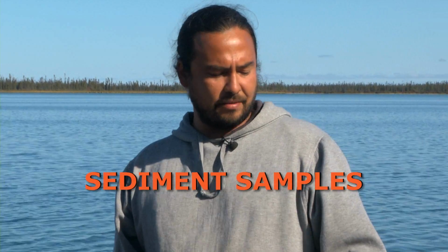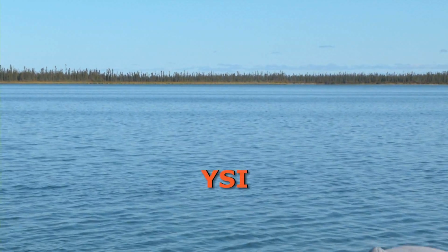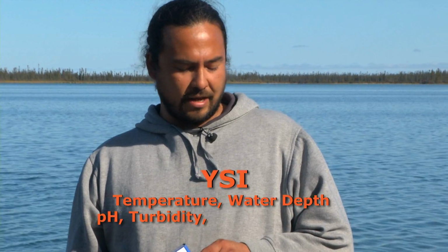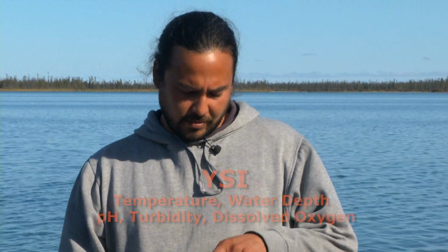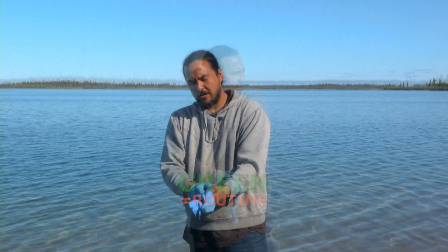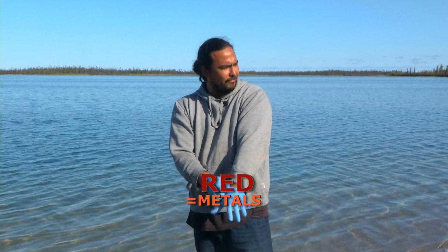We'll be doing the regular water samples. We'll be taking a sediment sample with the Ekman dredge, and then we'll be doing YSI, which will tell us the temperature, water depth, pH, turbidity, and dissolved oxygen in the lake. There are 3 different color jars. We have green for routine, black for nutrients, and red for metals.